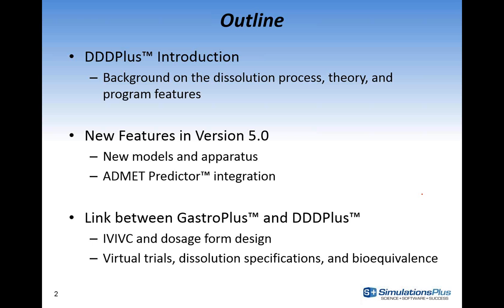Today, first we'll be going through an introduction to DDDPlus, the background of the dissolution process, theory, and program features within DDDPlus. After that, we'll be going into the new features that we're providing in the new version 5.0, the new models and apparatus that are available for simulation, and more importantly, the ADMET Predictor integration that we've included in DDDPlus 5.